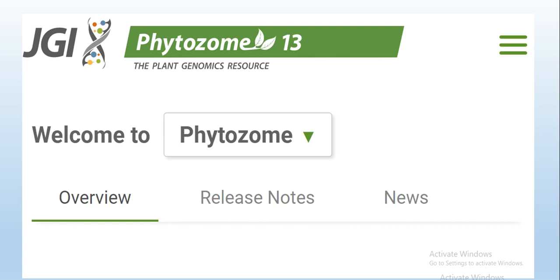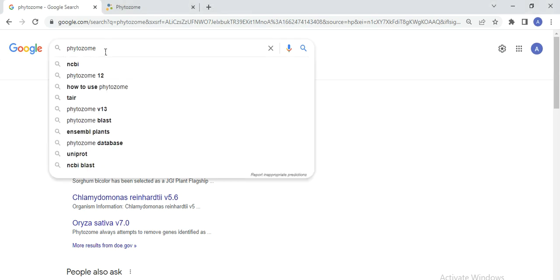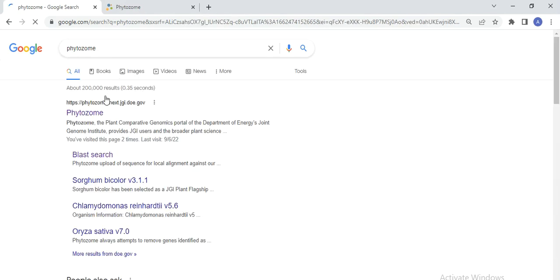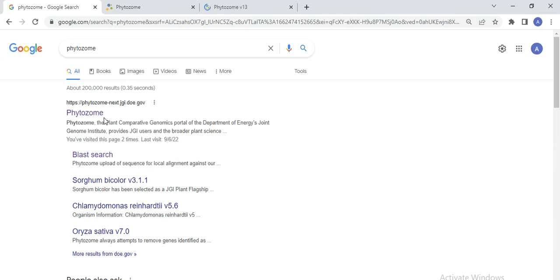So, how to download sequences from your studied plant's genome using Phytosome version 13 — let's start. Open your browser, whether you are using Google or any other, and write Phytosome in the search bar and click. Then you will see this link — open the first link.